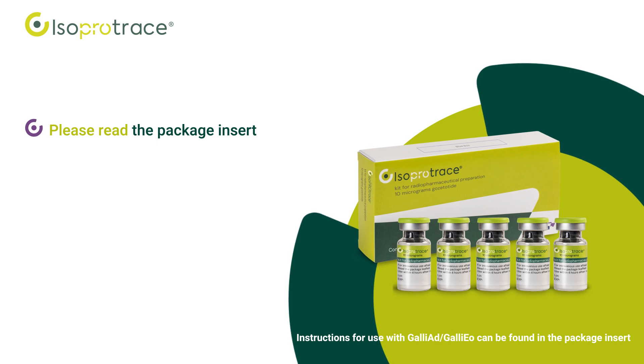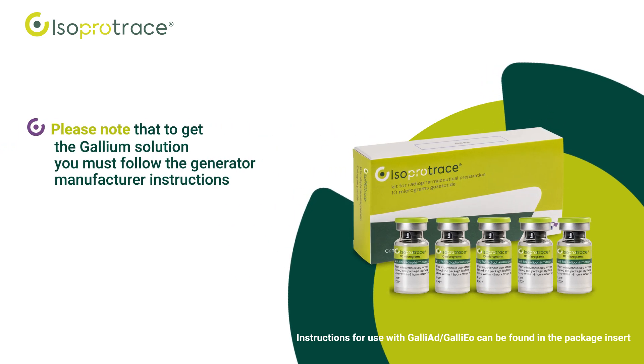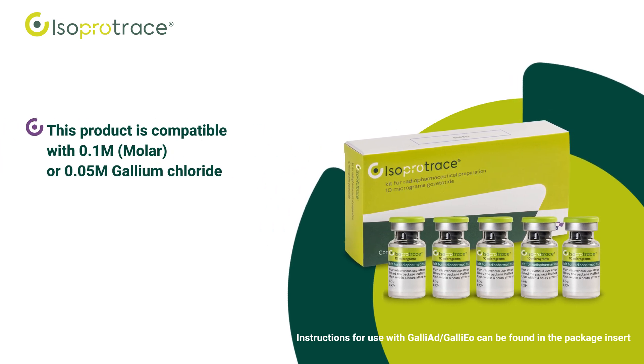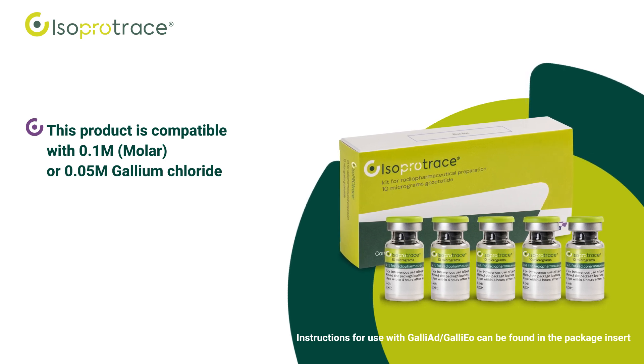Before the preparation, please read the package insert for detailed requirements. Please note that to get the gallium solution, you must follow the generator manufacturer instructions. This product is compatible with 0.1 molar or 0.05 molar gallium chloride.